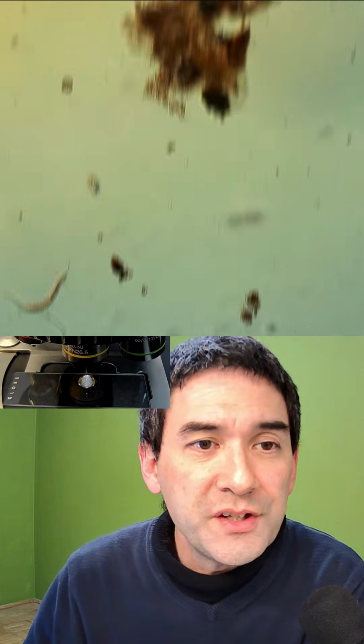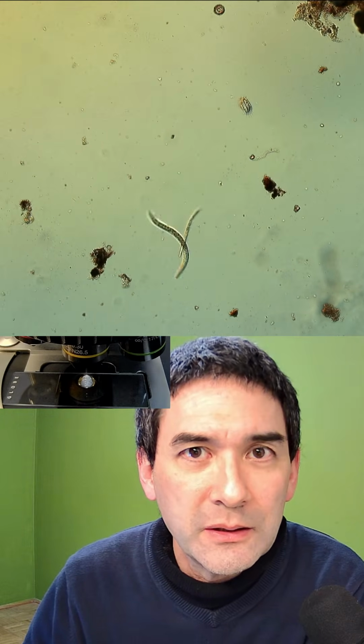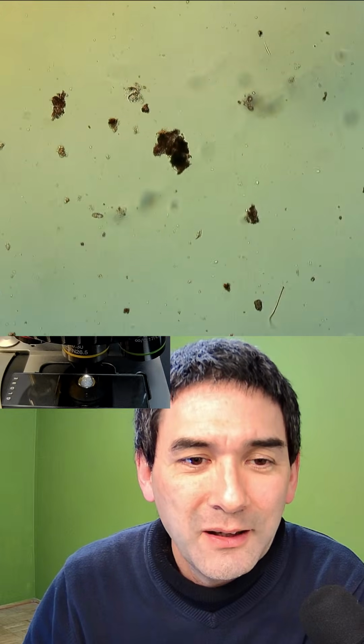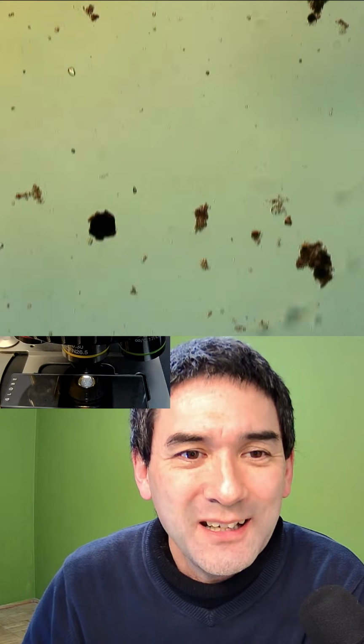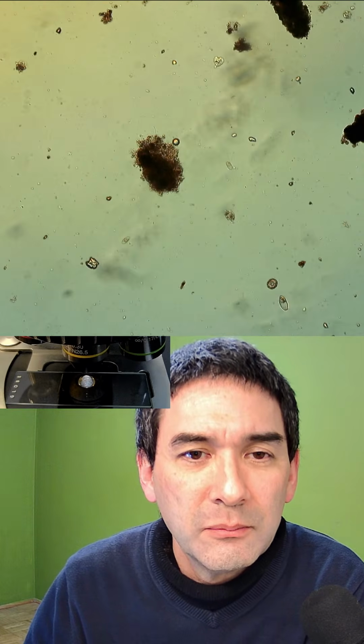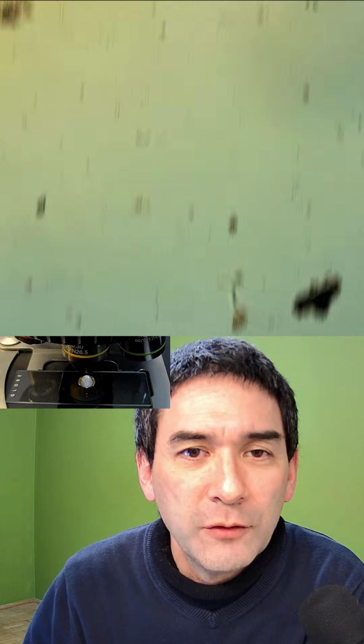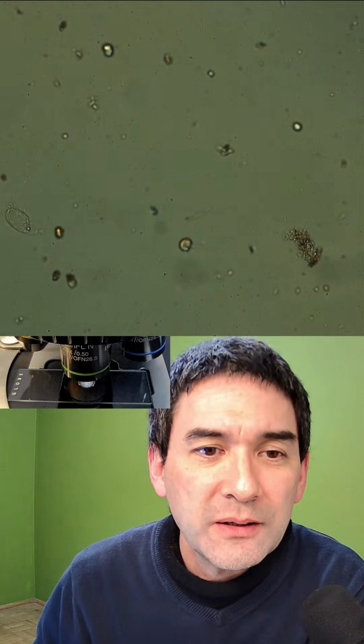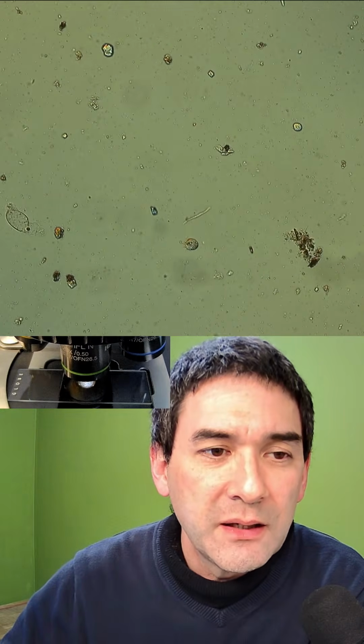I just wanted to show you this as one of the things I just discovered in this flower pot water, which looked pretty unappetizing. I found a couple of ciliates, mostly nematode worms. I have some rotifers. Here, plenty of worms as always. Some more or less interesting ciliates, of course. That's something I think we all like to do.